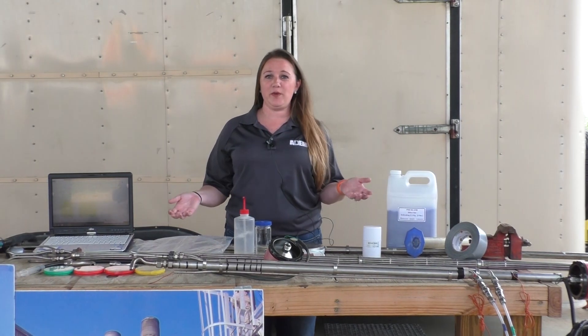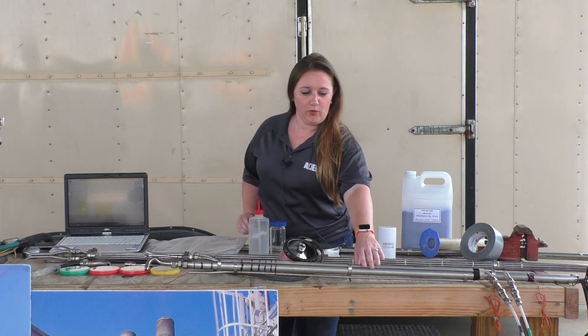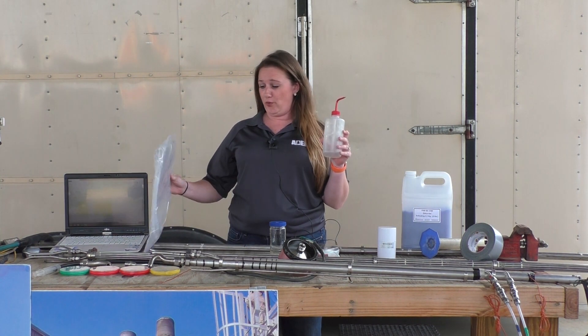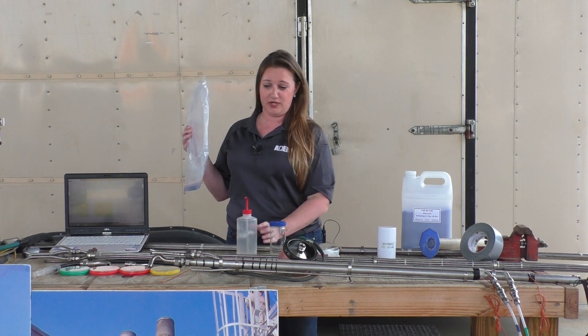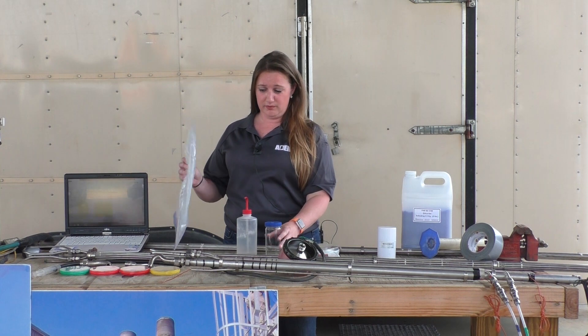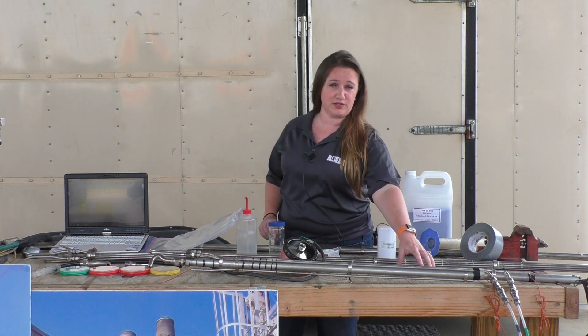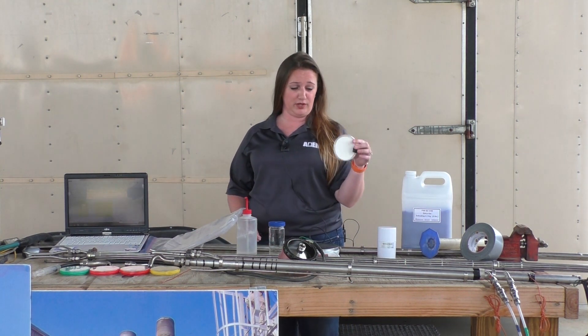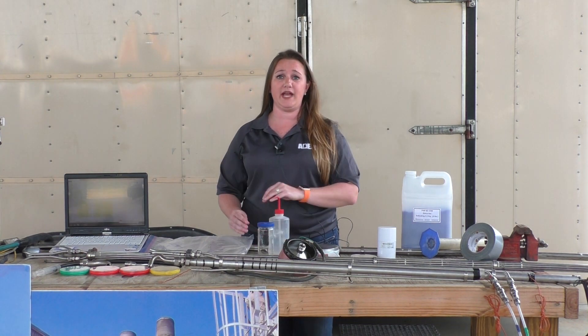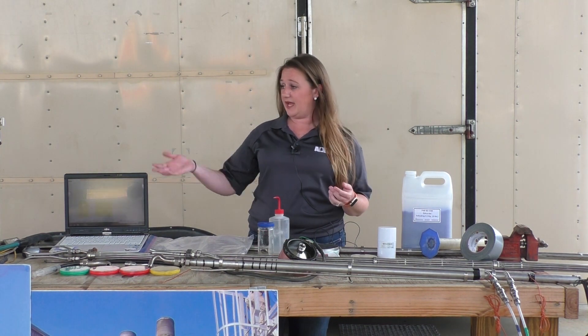So after every particulate run we do, we're going to take our probe and filter, and we're going to clean the probe with a brush, acetone, and collect it in a jar. We're going to take that mixture, as well as the filter that came out of the filter holder, and we're going to take it all back to our lab, dry it out, weigh it, and use all the data we collected to determine if the facility was in compliance or not.